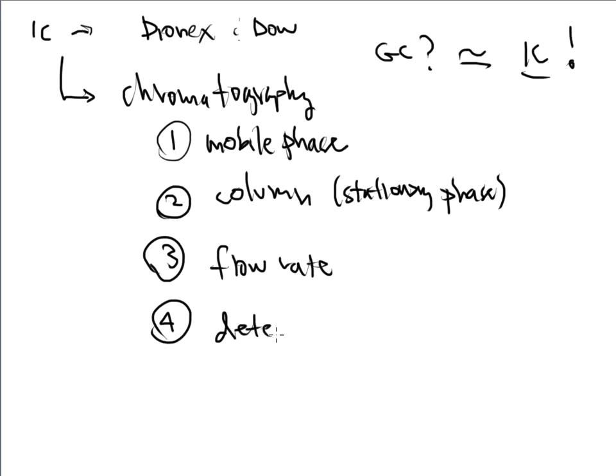And finally, detection. You know, everything has to have a detector. The GC had a detector. It had multiple different types of detectors, basically measuring whatever you want it to measure. We had a detector for pretty much everything that was out there. The same thing happens with ion chromatography. In the field of ion chromatography, we have to have a detector. What is that common detector that you might see on an instrument, and are there different versions of that detector that are out there that will allow us to expand our capability and measure other things that we maybe wouldn't expect to use an IC for?